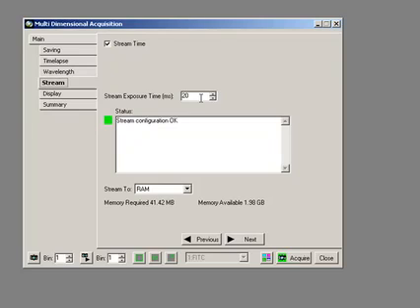That can be anywhere up to about 99 milliseconds if you have transfer time involved as well. But realistically, we're going to stream at the rate of the camera's fastest speed in this bin state, which is 10 frames a second.